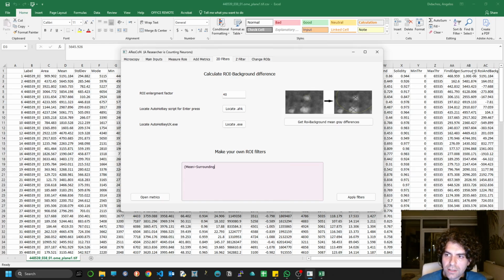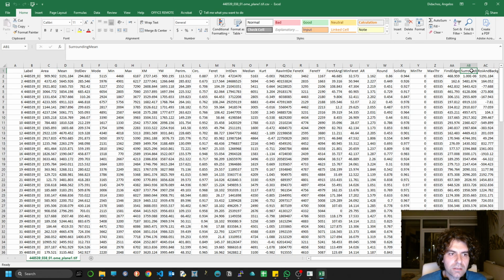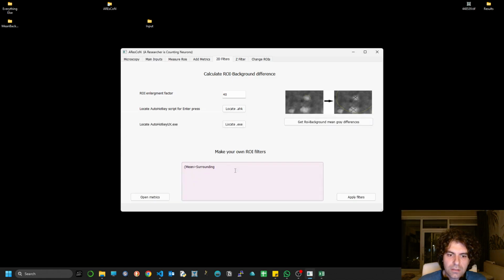I can see how exactly it's written if I just click here. Alright, surrounding mean times 0.3, for instance, right?